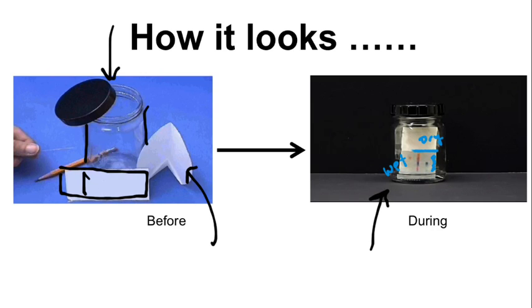As soon as you open up that jar and take your TLC plate out, there's nothing to replenish it, and it ends up drying out. Okay? The solvent evaporates off, which means as soon as you decide your reaction's done and you unscrew your cap, you'll pull out your TLC plate and you will immediately mark. It is an immediate thing, because if you decide to wait, you're going to end up losing it. You would mark right along where our solvent front was. We said, okay, there's the solvent front. And we're going to talk about why that solvent front is so important here.